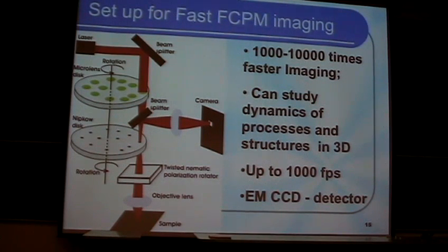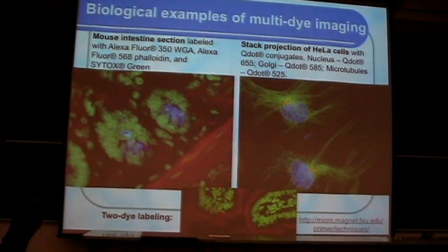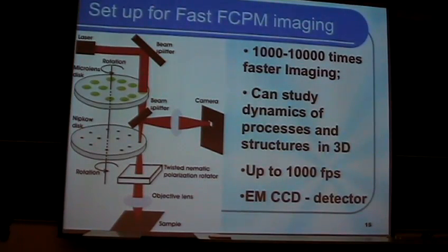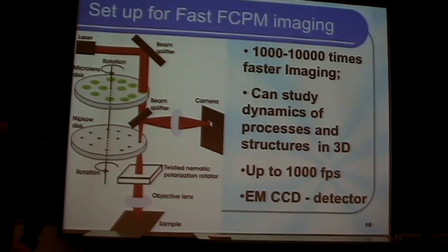And so this means that to obtain a good image of this quality, it usually takes you seconds, or in the case if you obtain a three-dimensional image, it can take minutes and even more. So this drawback of the confocal microscopy, as you understand, would not allow you to do dynamic imaging of different dynamic processes in both biological and material systems.